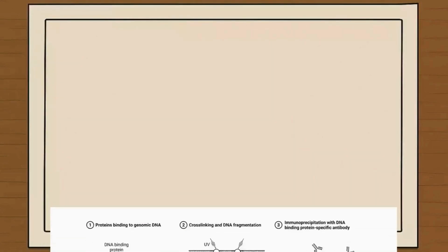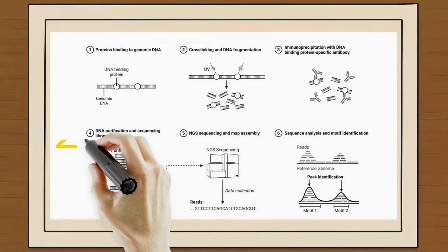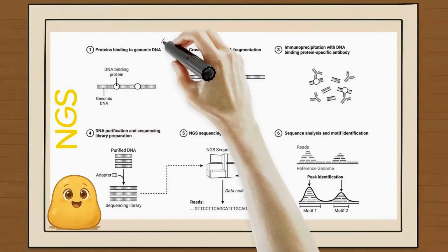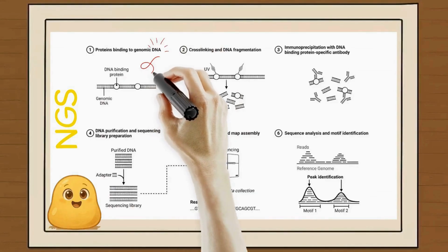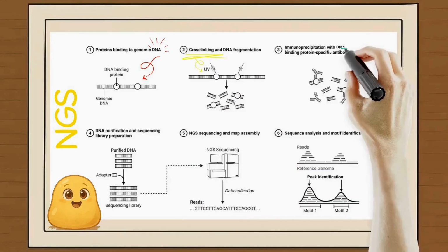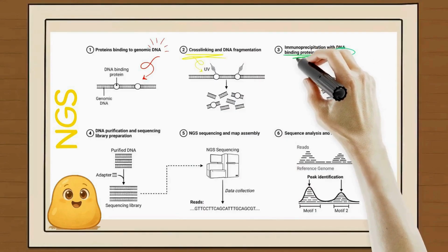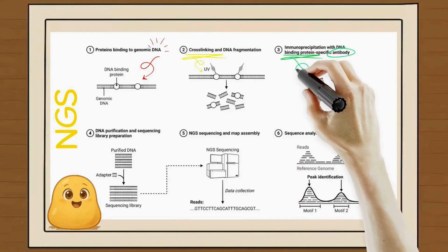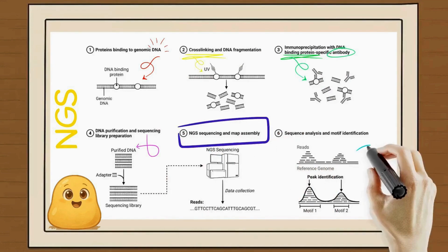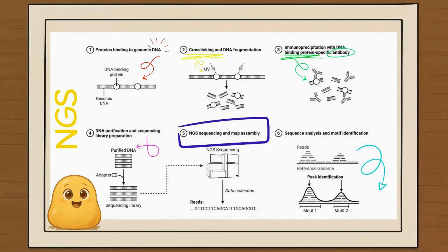Next-generation sequencing, NGS. This is the powerhouse of modern sequencing. NGS technologies allow for the massively parallel sequencing of millions of DNA fragments at the same time. This dramatically increases the speed and throughput, making it perfect for sequencing entire genomes, a process that would be impossible with traditional Sanger sequencing. There are several types of NGS, including pyrosequencing and single-molecule sequencing, all designed to read genetic information in real time. These technological leaps have made sequencing faster, more reliable, and much more accessible.